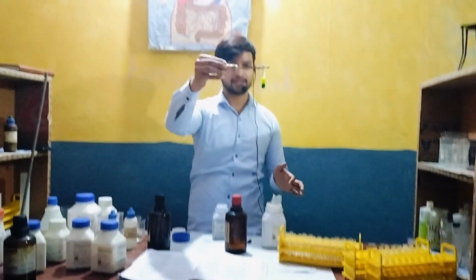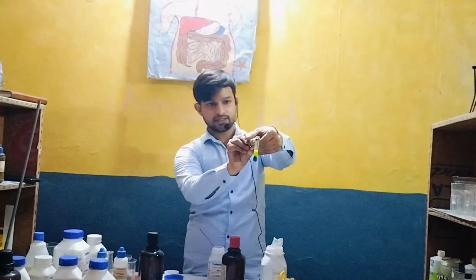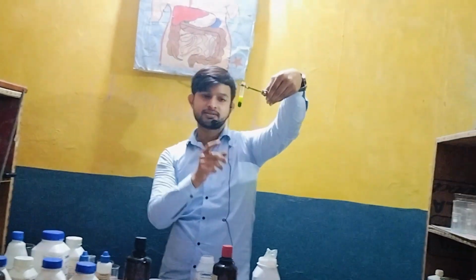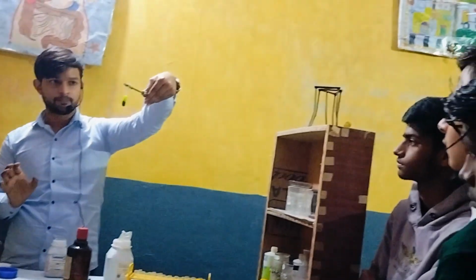As you can see the brown color copper, you can see? Yes, sir. Yeah, please see it again from this side. You can see a brown color layer. This is copper. The color of copper is brown, tamba. You can see here. So the copper will separate out. Okay?